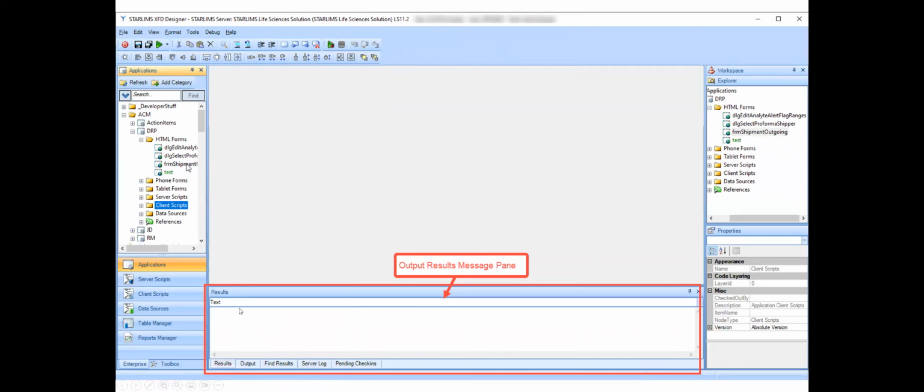When you click on that, we'll see a detailed listing of any variables that may be missing or misdefined or improperly defined, or any number of different scenarios, whereby even syntactically missing a semicolon at the end of your server script line, which is a line termination character in STARLIMS. If that's missing, the most wonderfully written code in the whole world will come to a crashing halt.